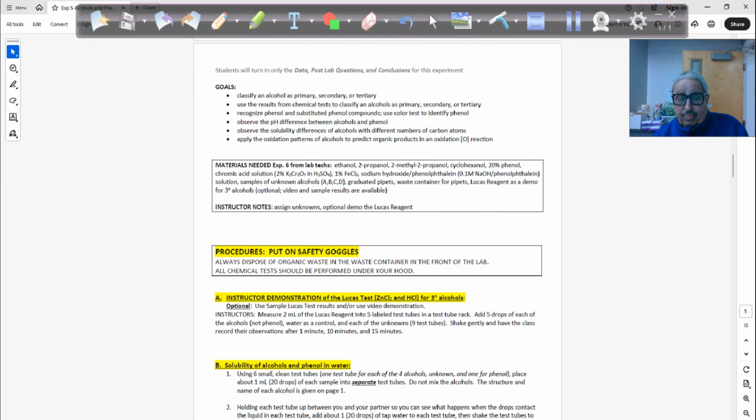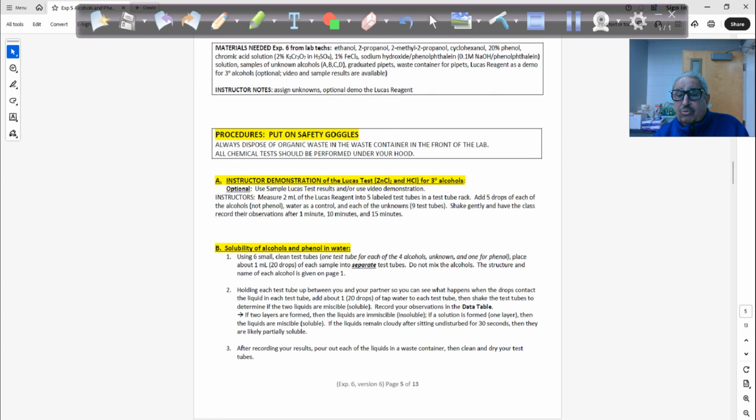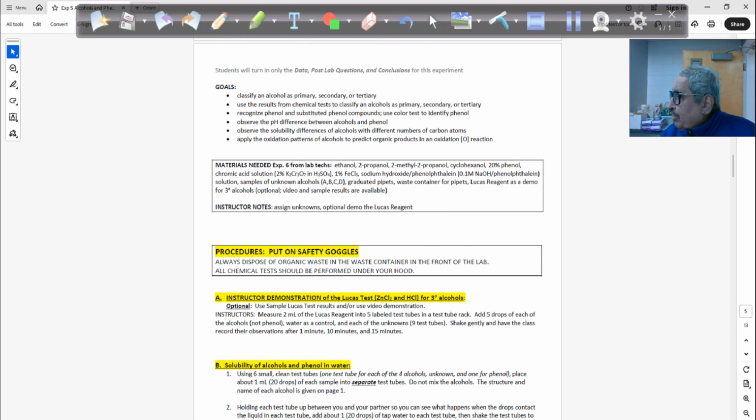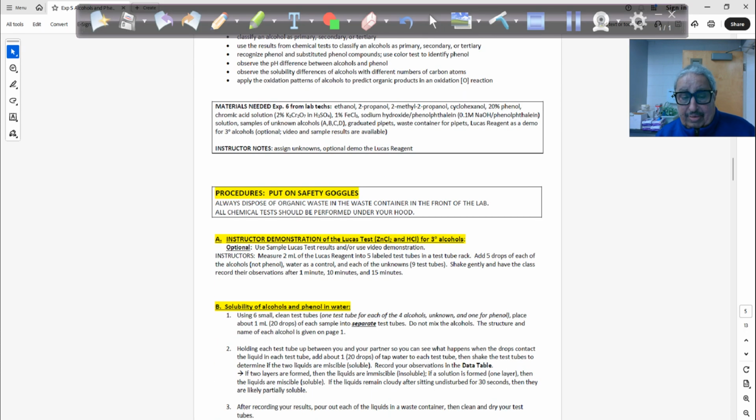Okay, guys, so I don't know why they give you the zinc chloride. I have to do it for you. Try to do it. It's not really difficult. You just take zinc chloride, HCl together, and then add a couple drops of this into those alcohols, primary, secondary, and tertiary alcohol. Correct? It said the demo was done by a professor, but no need. You can do it yourself. Zinc chloride is the catalyst, and the reaction is with HCl. Then the tertiary will react only.